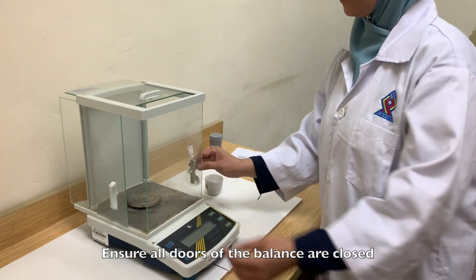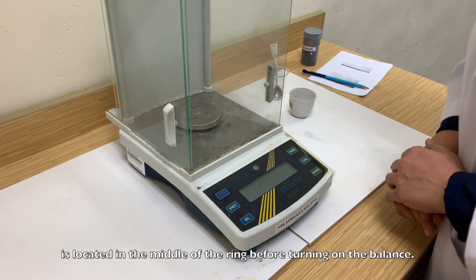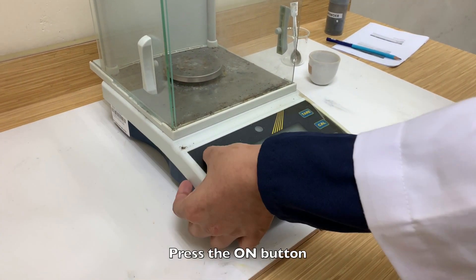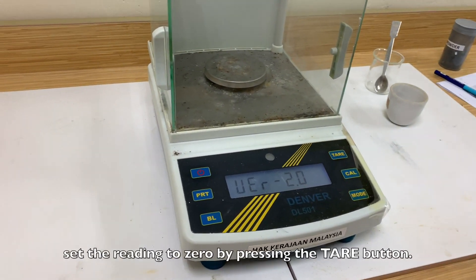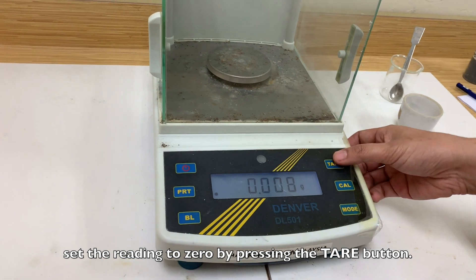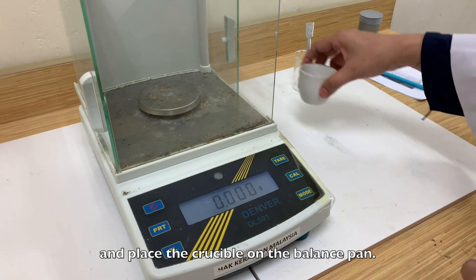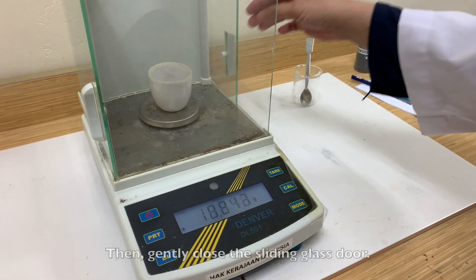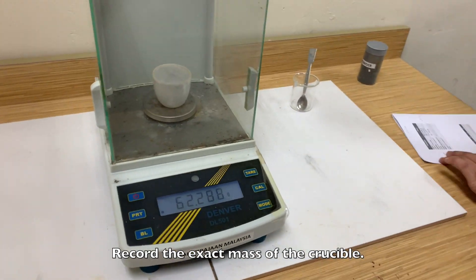Ensure all doors of the balance are closed and the air bubble in the spirit level is located in the middle of the ring before turning on the balance. Press the ON button. Once the balance is initialized, set the reading to 0 by pressing the tare button. Open one of the side doors, place the crucible on the balance pan, then gently close the sliding glass door. Record the exact mass of the crucible.